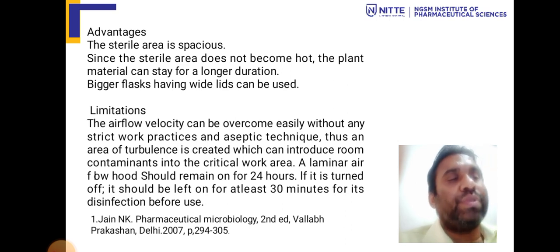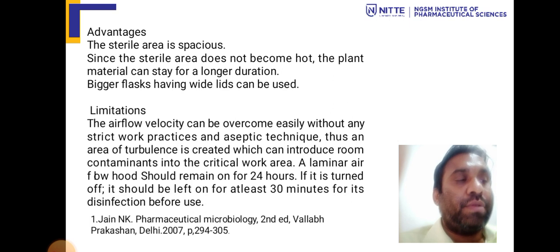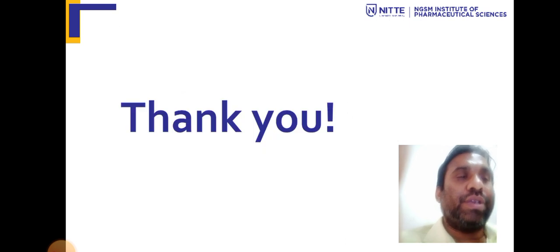This whole chapter is taken from the reference of N.K. Jain, Textbook of Pharmaceutical Microbiology, Vallabh Prakashan, Delhi. To summarize what we have learned: what exactly is the laminar airflow hood? We have seen the two types of laminar airflow hood, one is a vertical laminar airflow and one is a horizontal laminar airflow. What are the principles, where it is used, what are the advantages, disadvantages, and limitations.